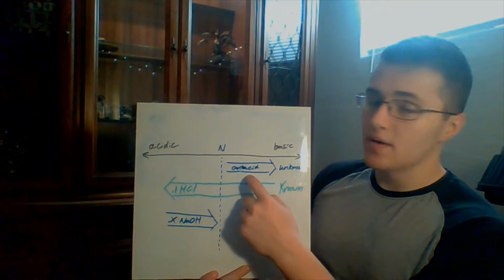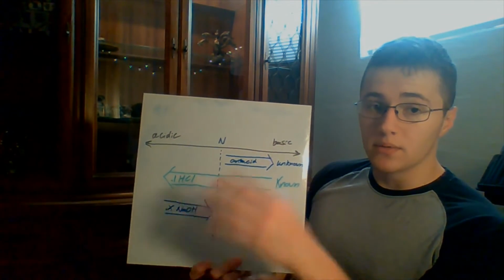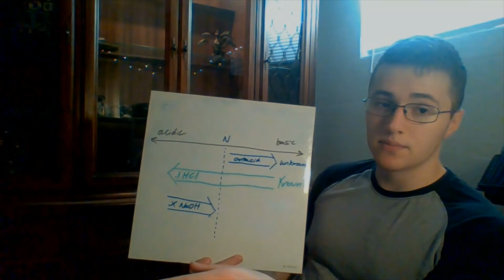Keeping in mind that if you're going to do just these two, you're going based off the numbers on the bottle. You're taking the word of the company over your own scientific principles.